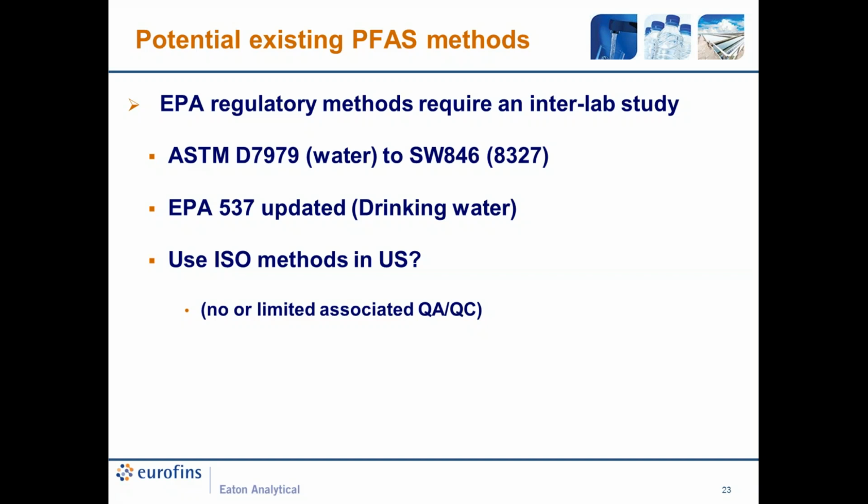ASTM, for political reasons, broke its own rules and did not conduct an interlab study on D7979. That study is now underway. In addition, EPA, as mentioned earlier, has validated a similar method as SW846-8327.